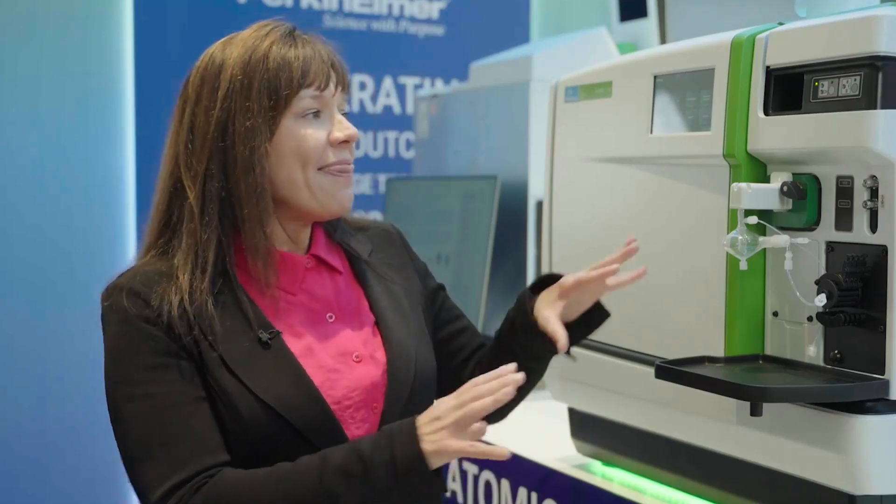It's a single analyzer triple quadrupole system, which means that the first quadrupole provides mass filtering — keeping out the mass interferences while keeping the neutrals and the photons out. And that's how we provide the lowest maintenance system on the market.